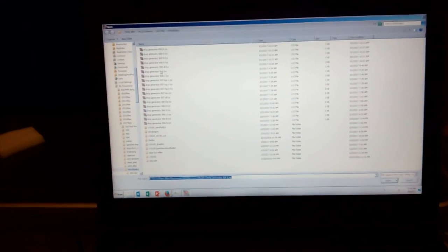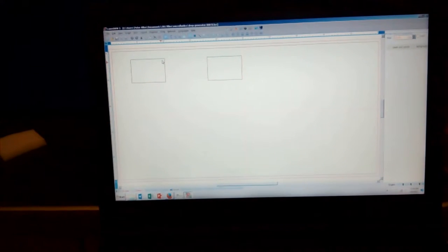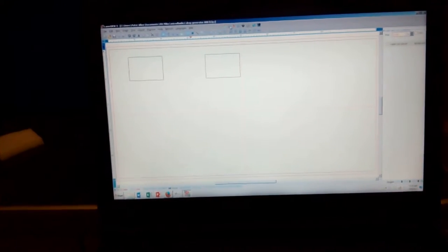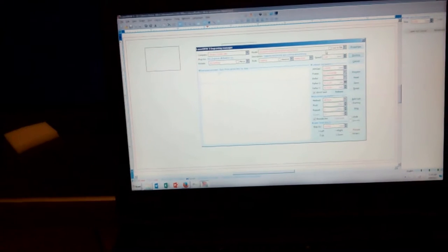Now if we don't want a full through cut, if we just want a partial cut as for the fluid channels, we need to make a whole new file with that particular design. So I've got a couple of squares here that I'm going to cut at a slightly different setting which I'll change on the software.